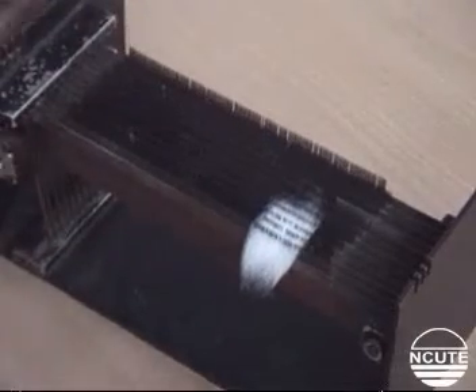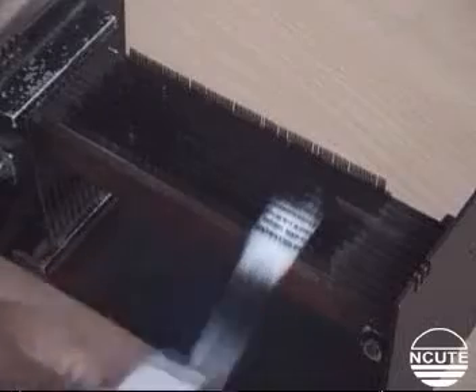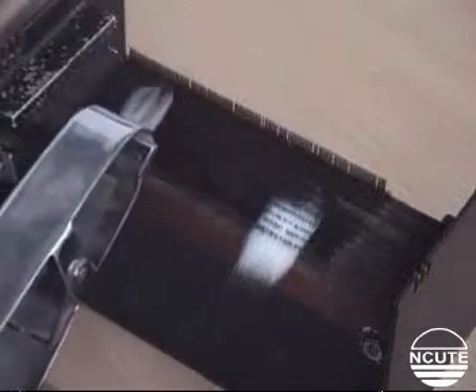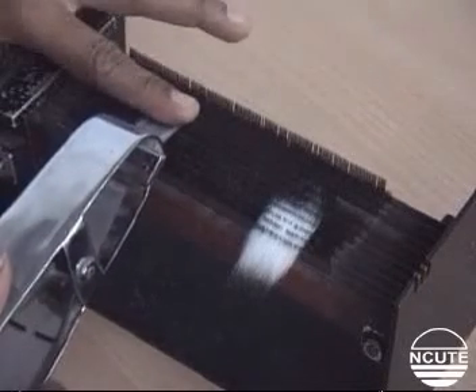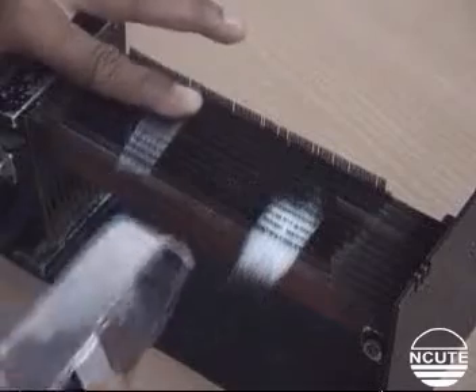Using the tweezers, grip the tips of the outermost protruding fibers, pull them out, comb them several times on the bottom combs, and finally place them on the bottom combs at the left hand side such that the gripped end is flush with the foremost comb as shown.